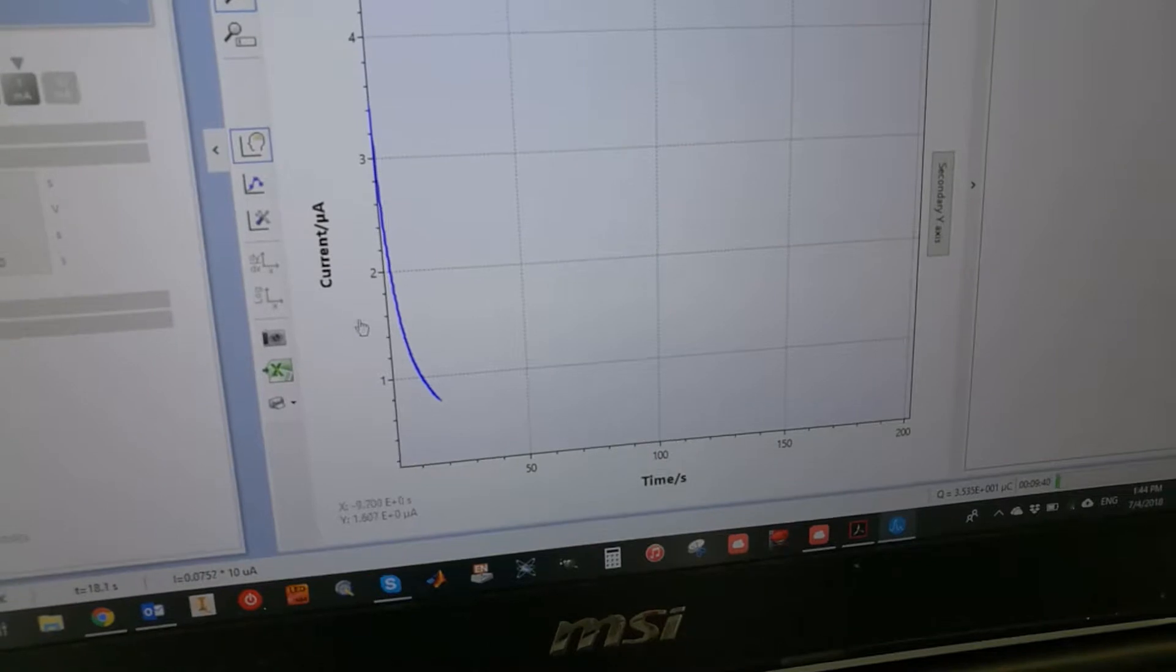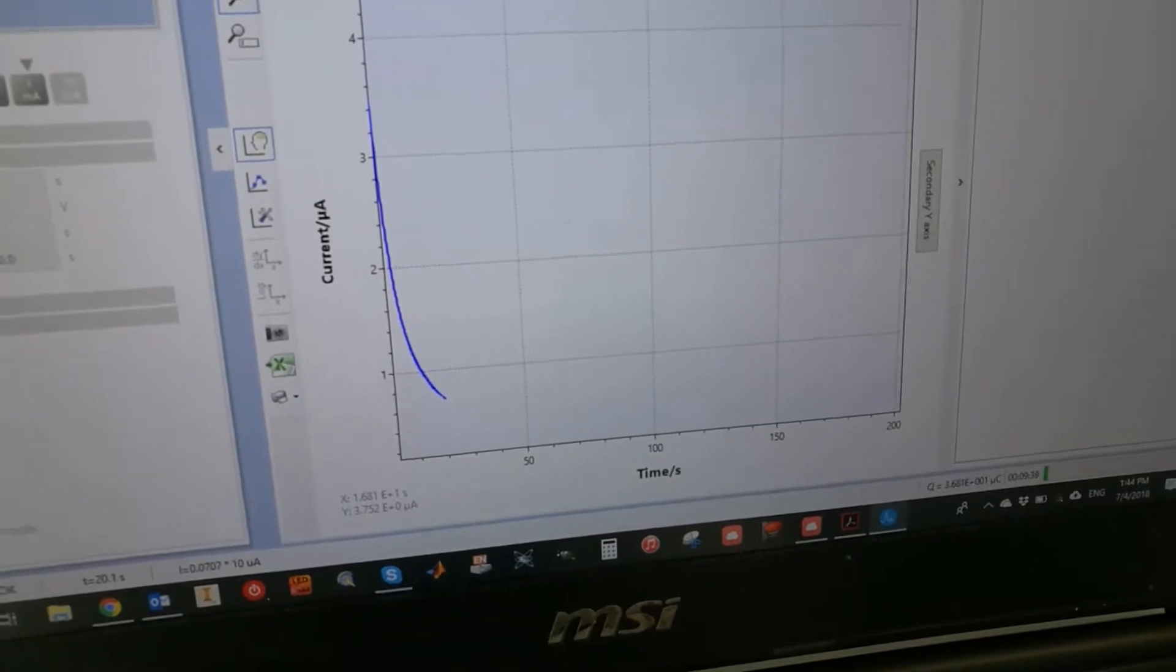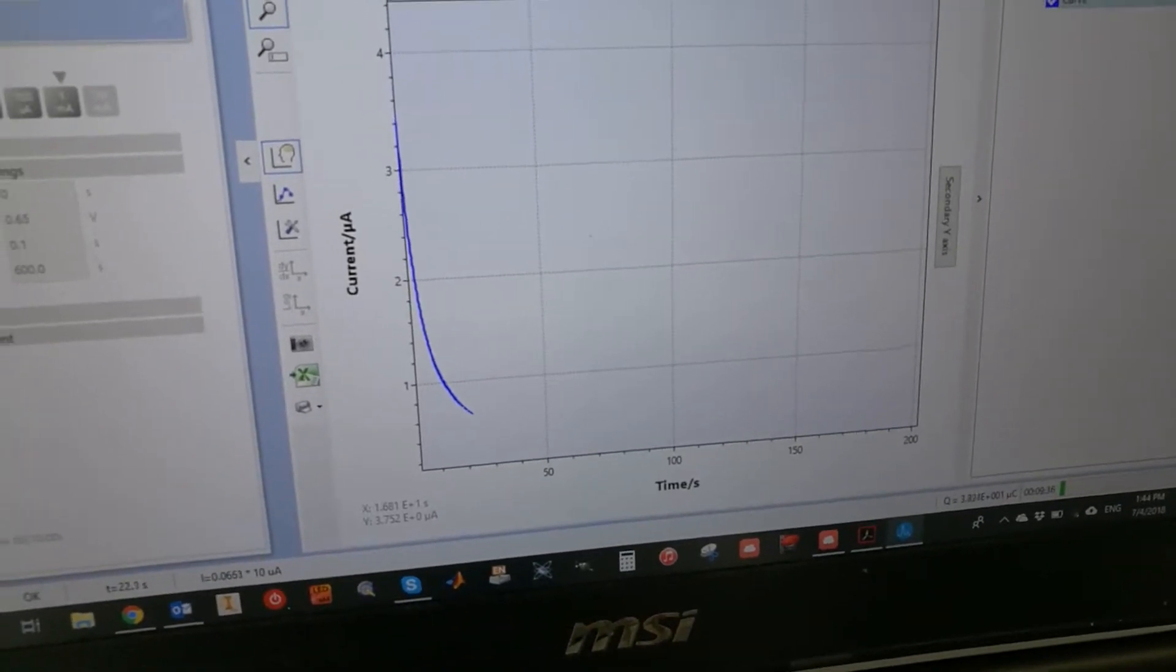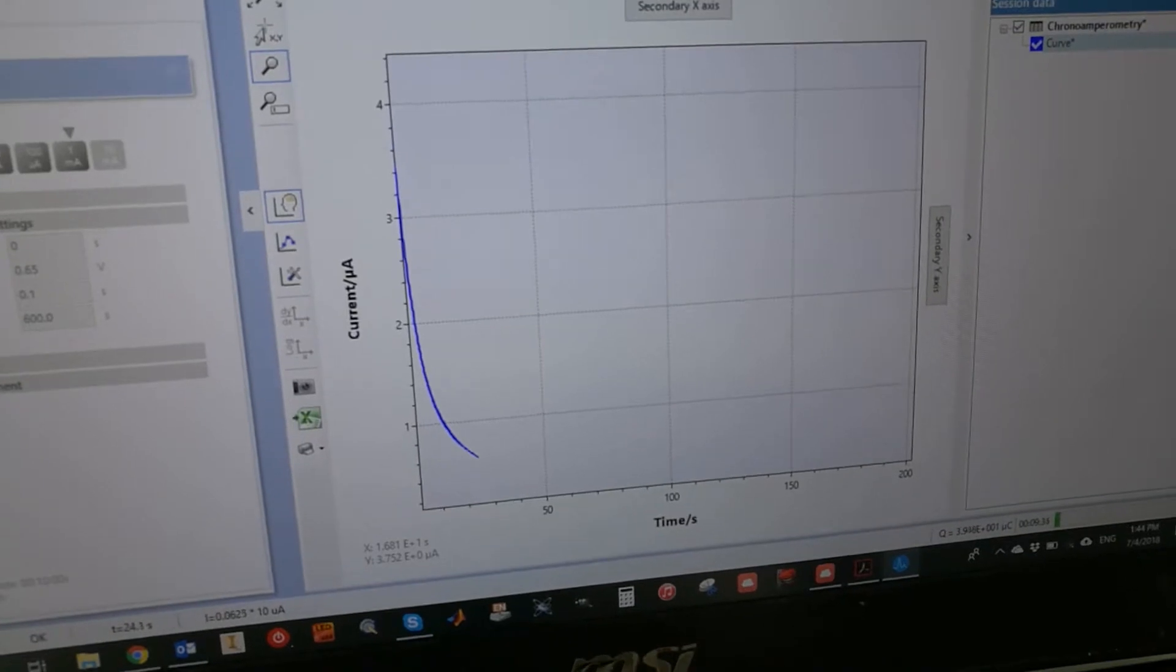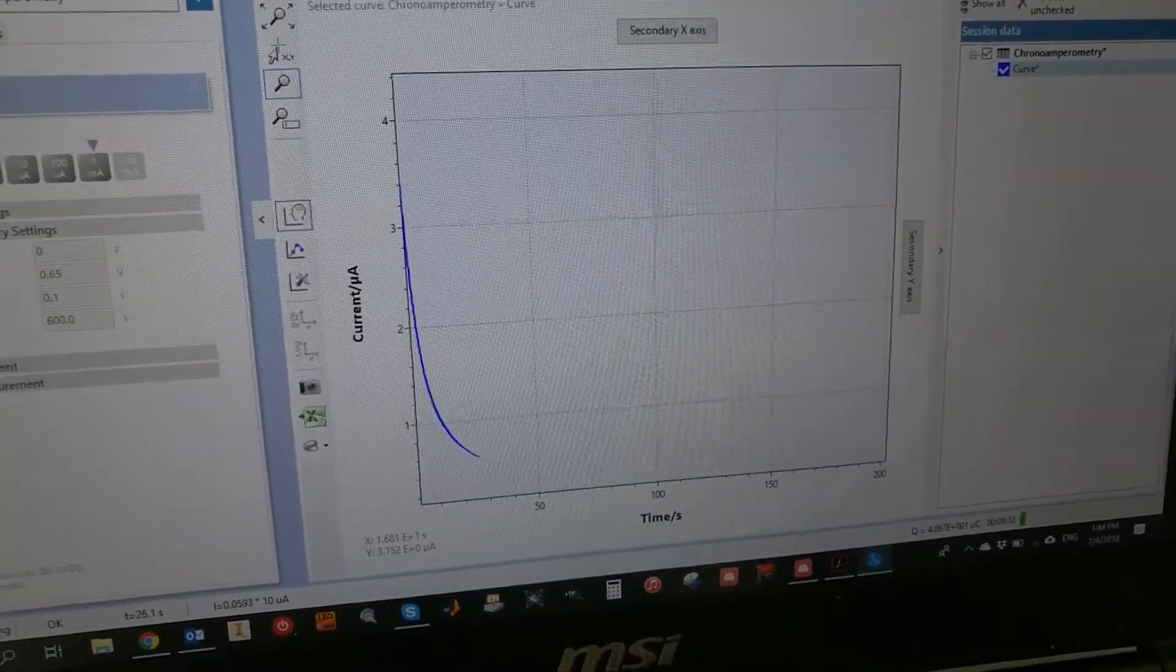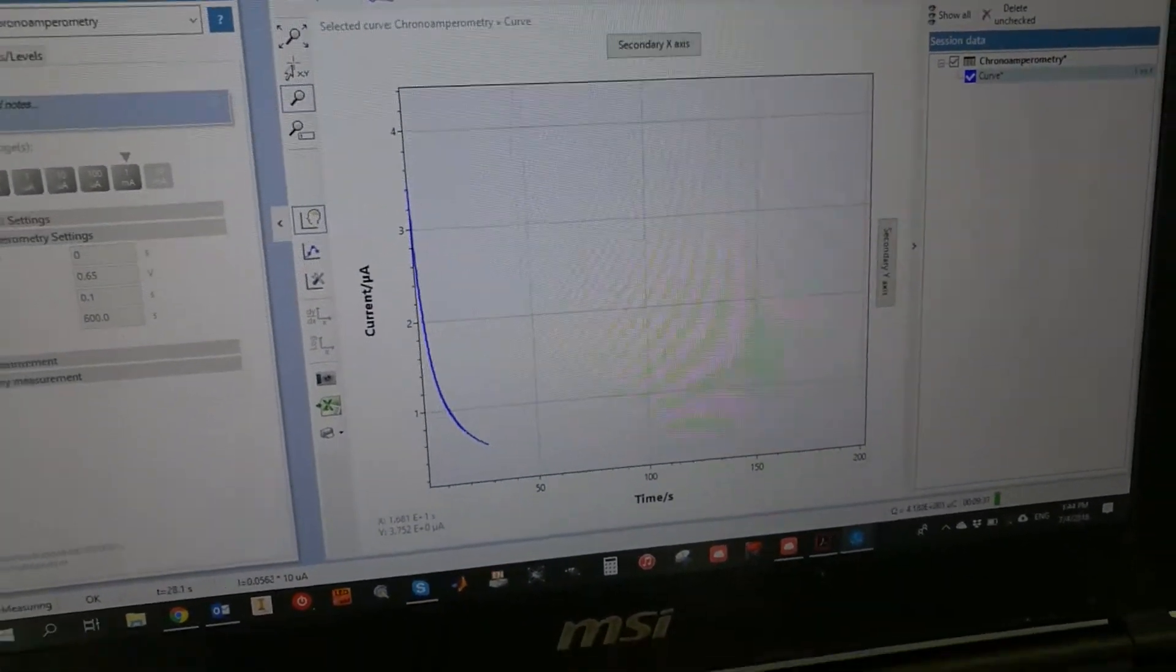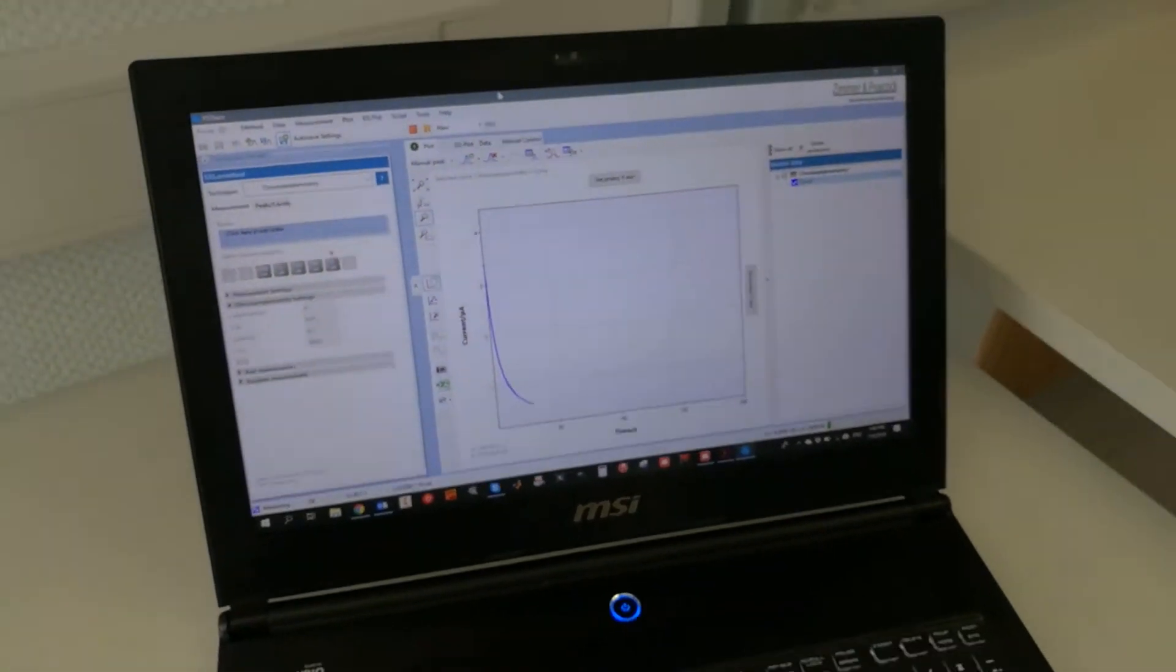I'm just trying to zoom around to make the viewer have a better perspective. And once this is done, the baseline is acquired, stable, the signal.